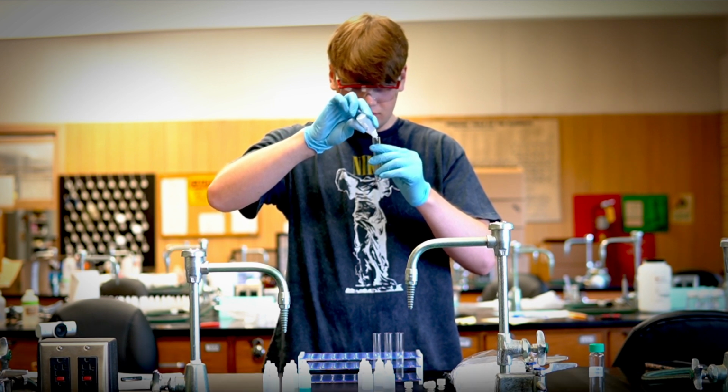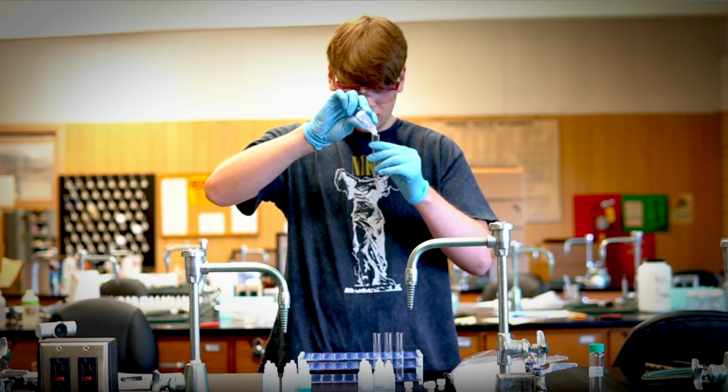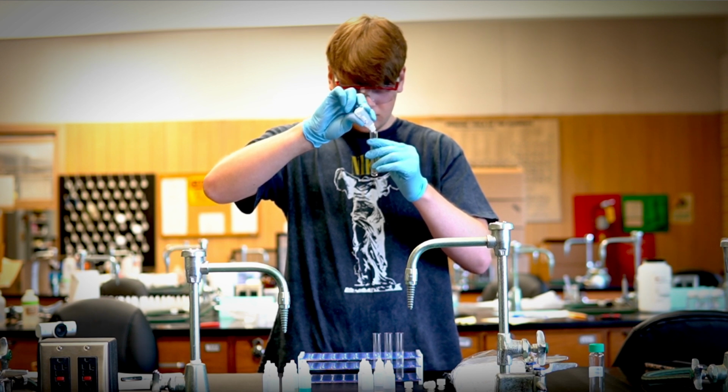And as the procedure calls, your samples will get about 1 ml into the test tube. That's about 20 to 25 drops. And you're going to add about 5 drops of your solution. Remember, this is a qualitative lab. We don't care too much about the quantity, we care about whether or not something is there. It's not a quantitative lab. So as long as you see a change, you should be good.